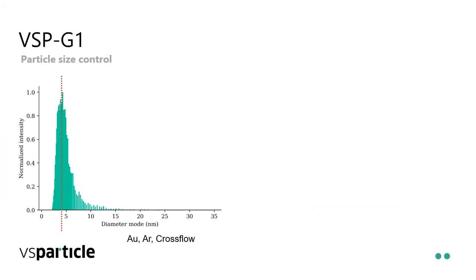As I said before, what comes out are particle size distributions. By themselves, they're not monodisperse, but for example, you have something like this. This is measured with a differential mobility analyzer, a DMA, where we look at the, let's say, the projected size, kind of like a kite. The bigger the particle is, the bigger the resistance it will experience as it's being pulled through a gas. And we use charged particles here. There's always a small fraction of the particles that have a charge. And so if you have a positive charge, you can use an electric field to drag a particle through this field and use that to separate out a particle, kind of like a mass spectrometer, but at atmospheric pressure.